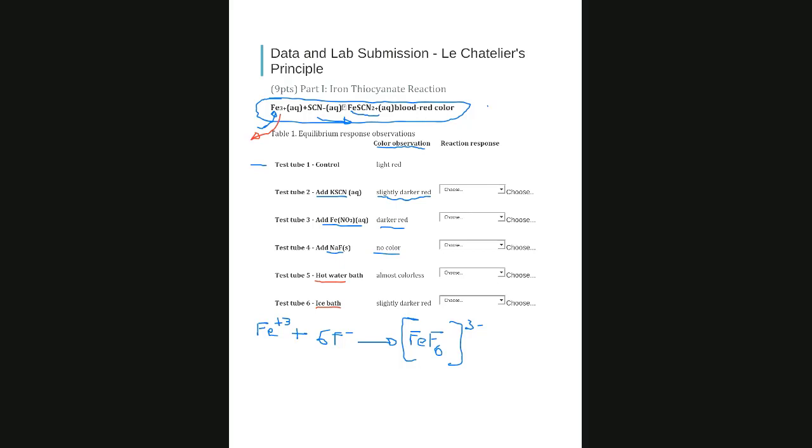Exactly, reactants. That's why the system shifts toward the reactants. This is your observation. And the opposite: in the ice bath, slightly darker. Which side in this reaction is darker? The complex, the product side, right? Yes, awesome. That's why we say it shifts to the product side. Does it make sense?